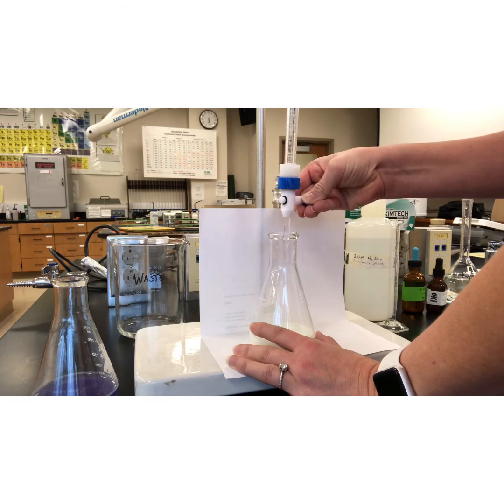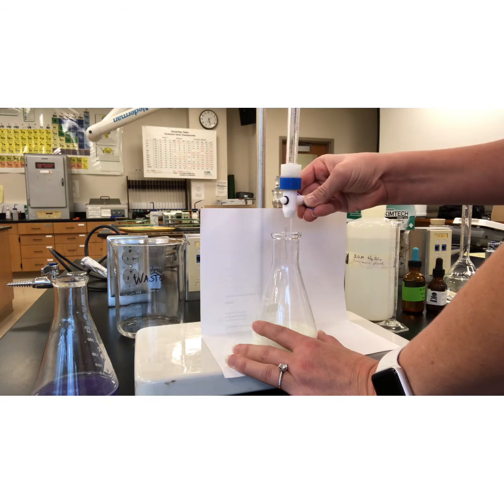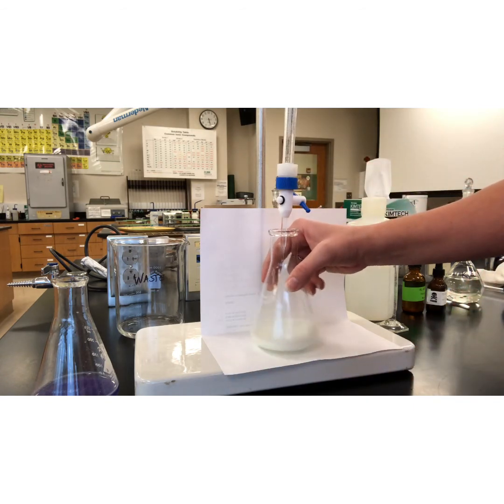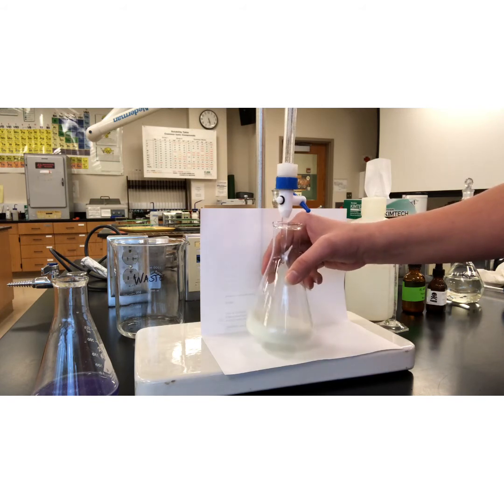And turn it on so it slowly drops. Come on. Come on. There we go. Drops coming out. I'm going to swirl and let it drop, all the while keeping an eye on my approximate volume and watching for that color change.